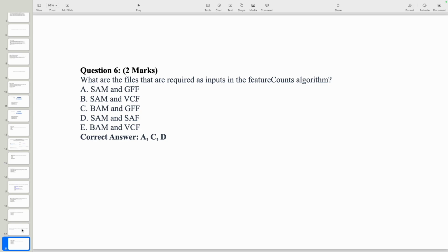So please go through this manual, take a few minutes. Yes, GFF and GTF files are the same kind of files, just with a few extra pieces of information in the GTF file. It is again the genome annotation file, like GFF.